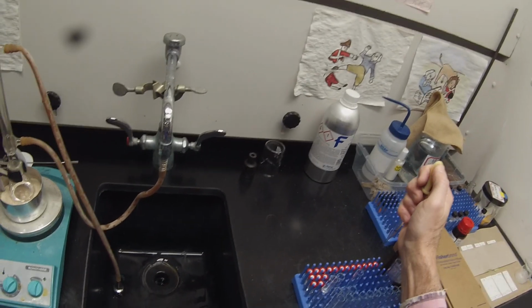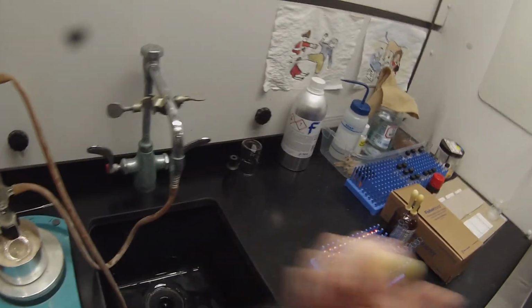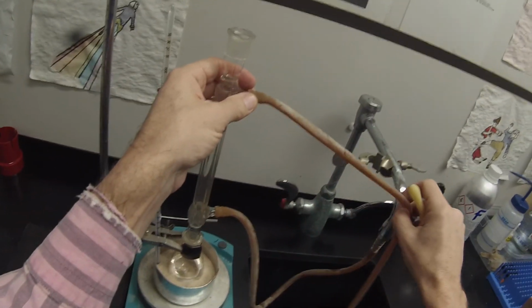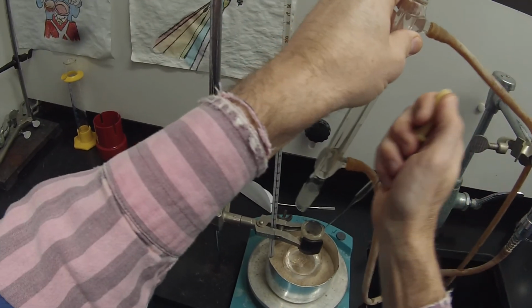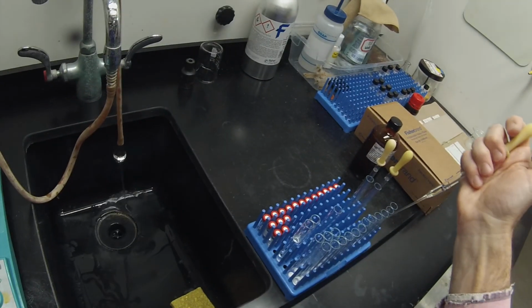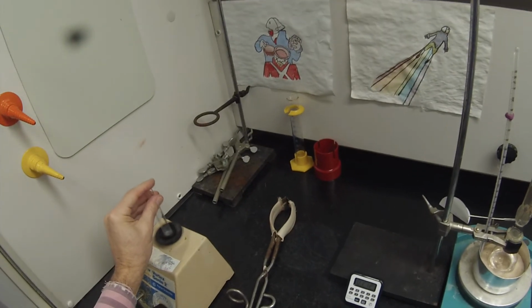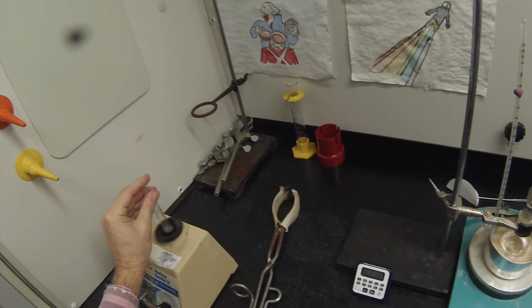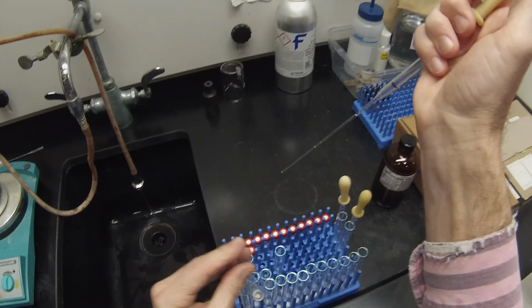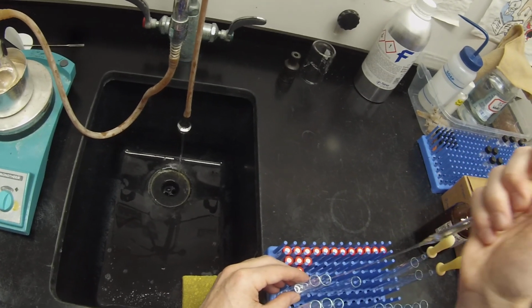And now I have my pipette at the ready to take my time equals 1 minute aliquot out. 54 seconds. So we're going to reach in there, so grab a pipette, approximately half a milliliter, stick that in there, and then we're going to vortex that. That'll stop the reaction, and then we'll quickly rinse this a little bit with the dichloromethane so we don't get carryover.